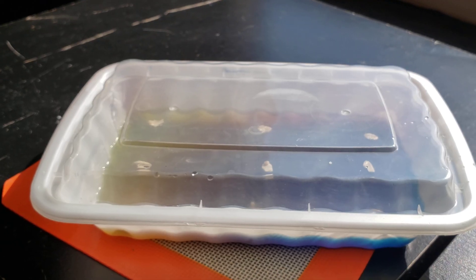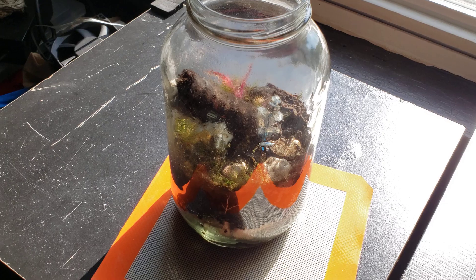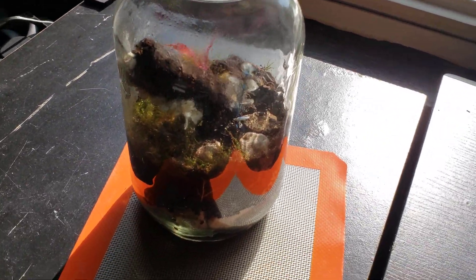We'll leave this one without the micropore tape since we already know the other one did well without it. As soon as I have an update for you guys I'll let you know. There's one other thing I wanted to show you.